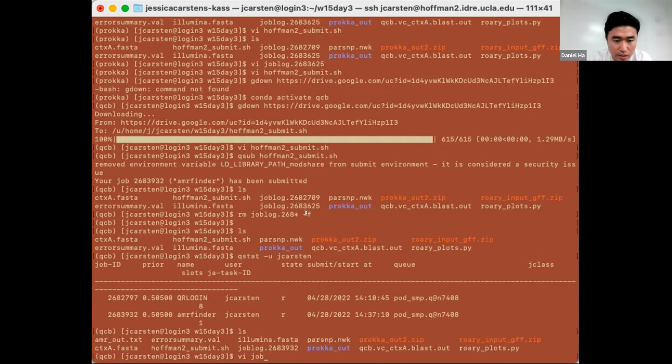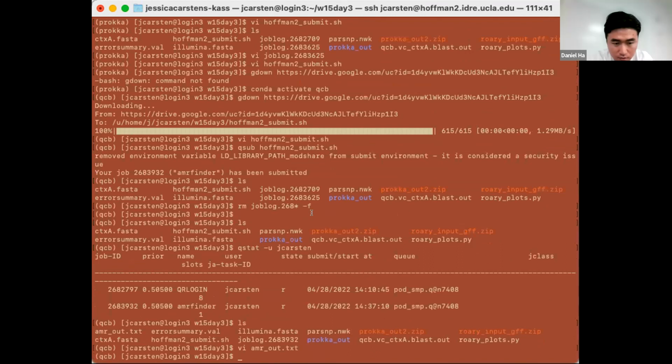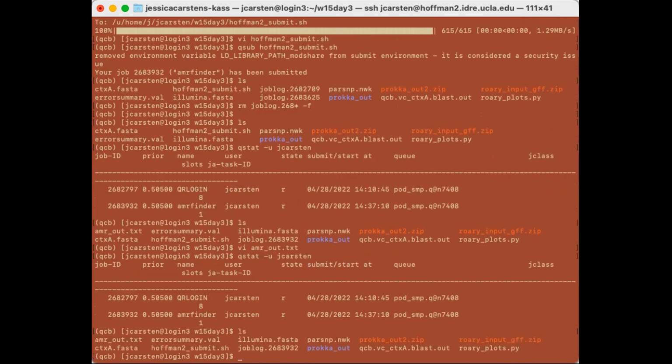Seems like you got it now. Oh yeah, there's the AMR output. It's still running, I guess, which is why it's empty. Thank you. You should get it.